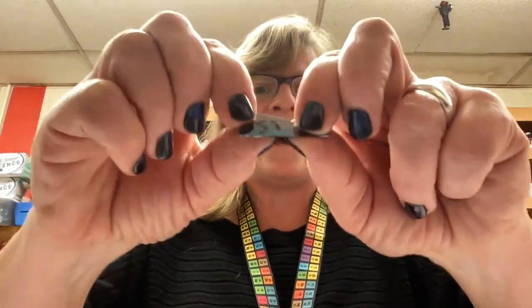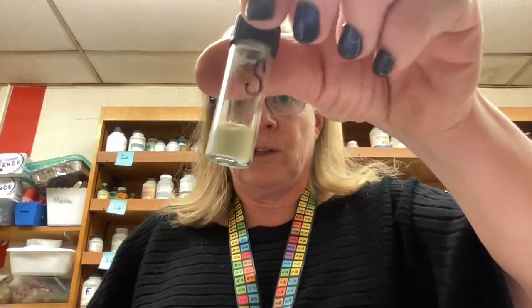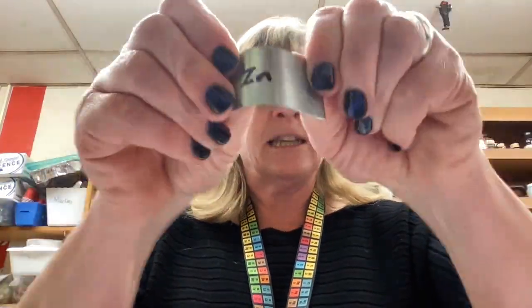Sample C. Sample C is silicon. You can see silicon again. It's sort of silver. It's very reflective, very shiny. It's also not malleable. Sample D. Sample D is sulfur. You can see sulfur is a yellow. It's a powder. You can also see that sulfur is not magnetic. Okay. Sample E is zinc. Okay. Zinc is shiny. It's silver. It is somewhat malleable.